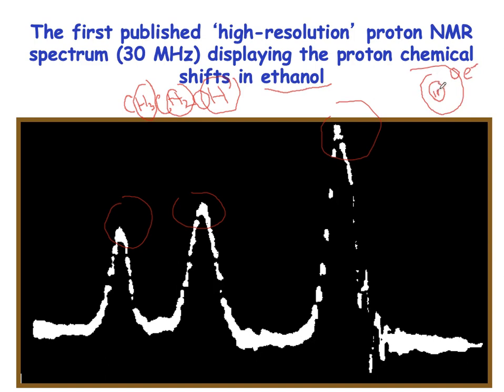So this technique is the technique in which radio frequency interacts with the nuclei of an atom. In case of hydrogen, the nucleus contains one proton. That's why, for hydrogen, we say proton in a nuclear magnetic resonance spectrum. So wherever we use the word proton, it means we are talking about hydrogen, because in the hydrogen nucleus there is only one proton, right?